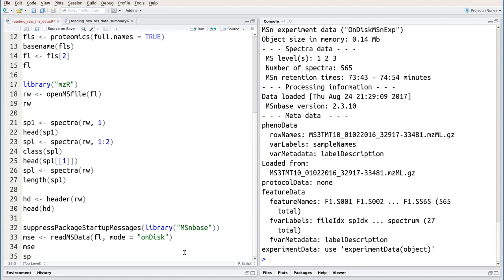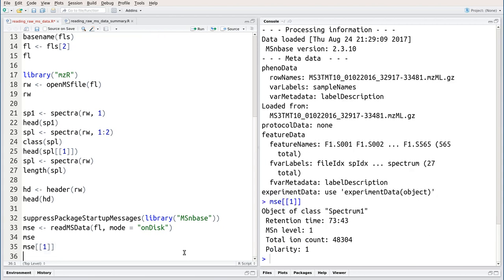As before, we can access individual spectra with the square bracket, double square bracket operator, like this. We can also access the annotation of this experiment and these individual spectra by accessing the header as we did before.